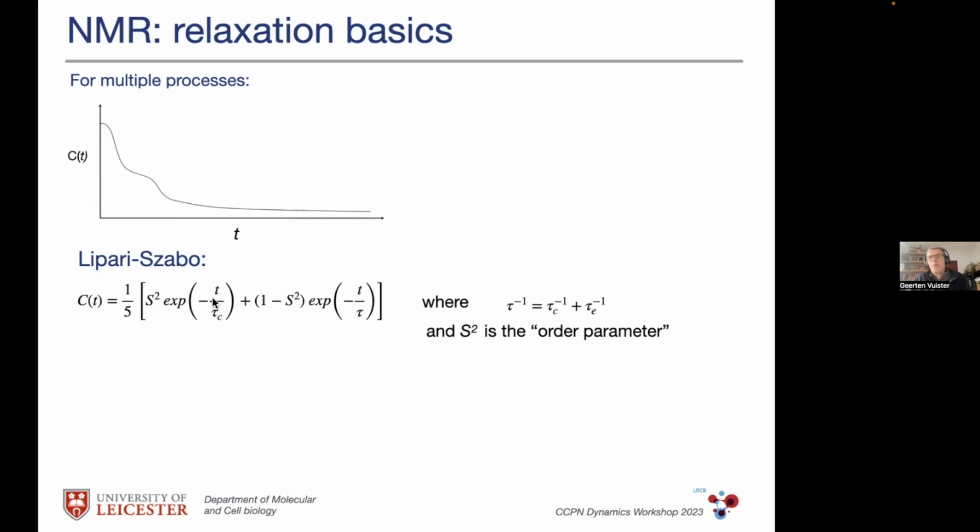And if we're also going to assume that the time scale of those two processes is sufficiently different, think about a factor of 10. So for example, if the one is occurring on the nanosecond timescale, then the other one should be sort of a tenth of a nanosecond, hundreds of picoseconds timescale, because that pretty much guarantees that they're independent.